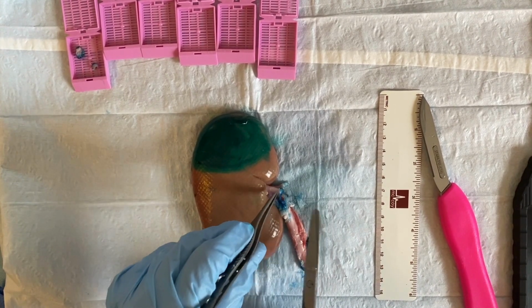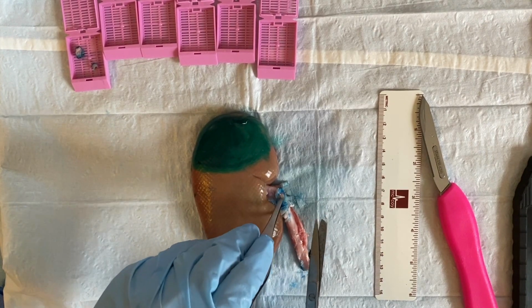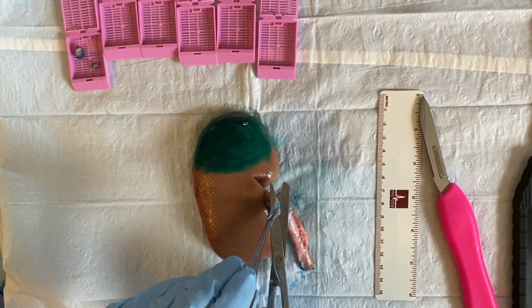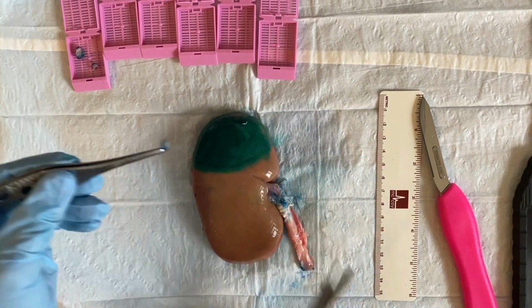Here I'm using my scissors to shave that renal vein margin, taking the forceps and cutting.